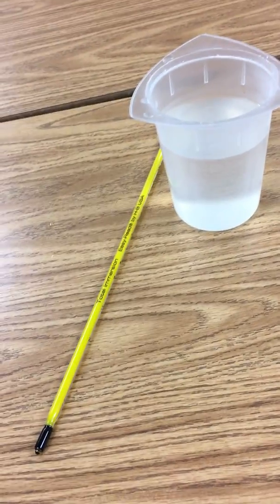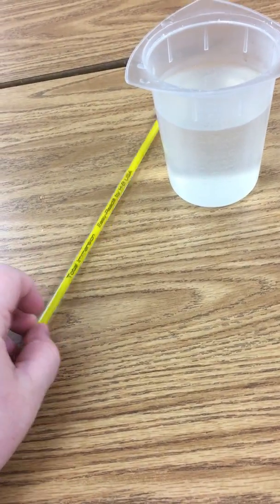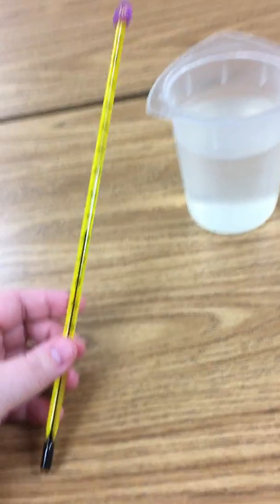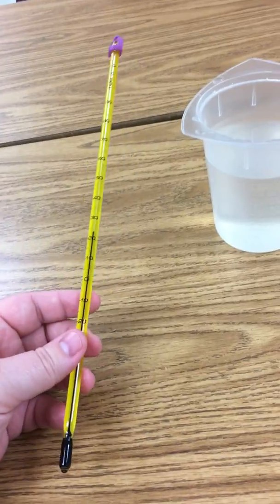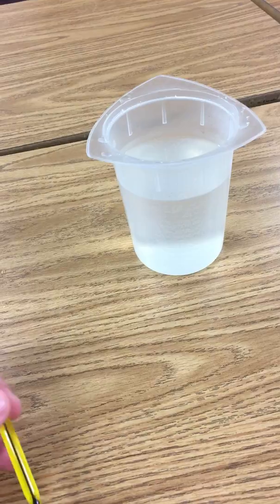Hey science students, Ms. K here and I just wanted to give you a quick tutorial on how to use a thermometer. Thermometers are used to measure the temperature of something, which is how hot or cold that object is, and we're actually going to focus on measuring the temperature of liquids today.